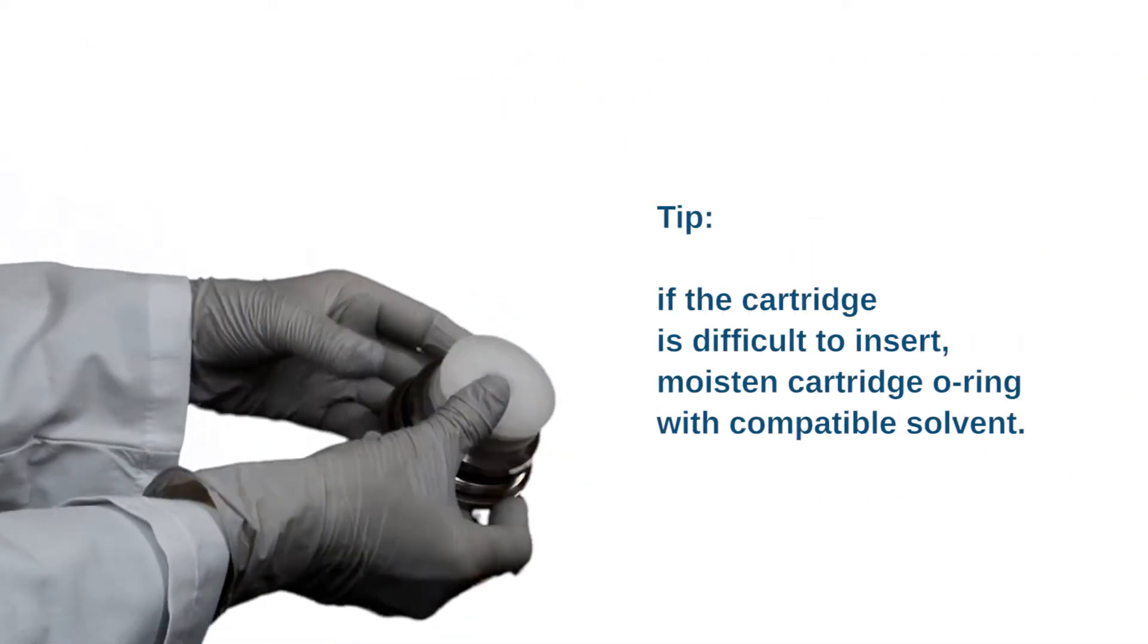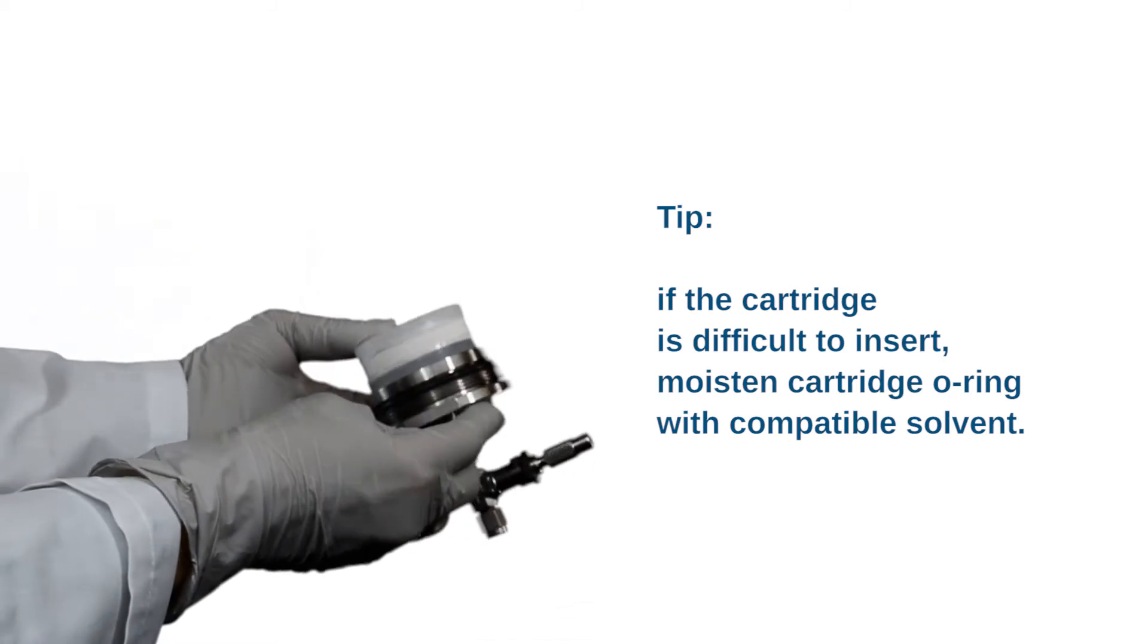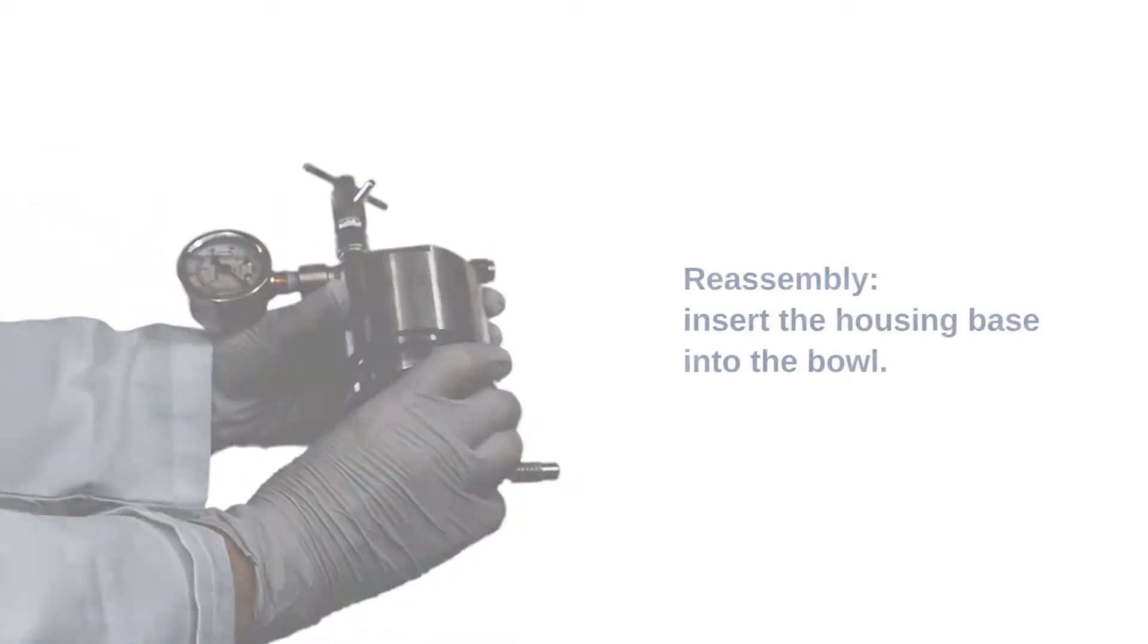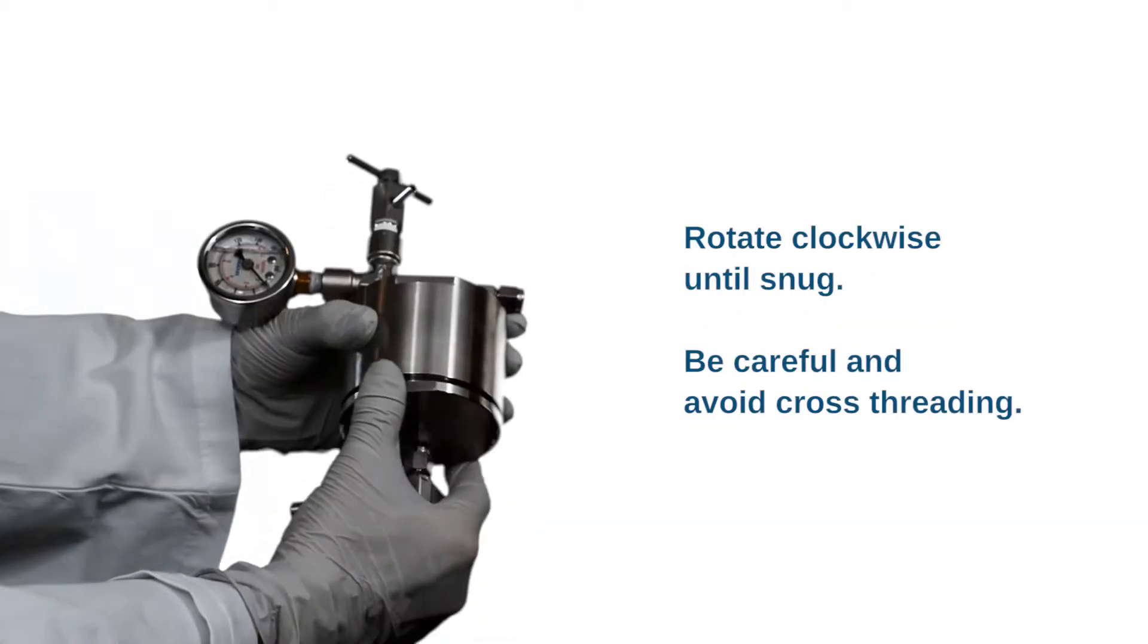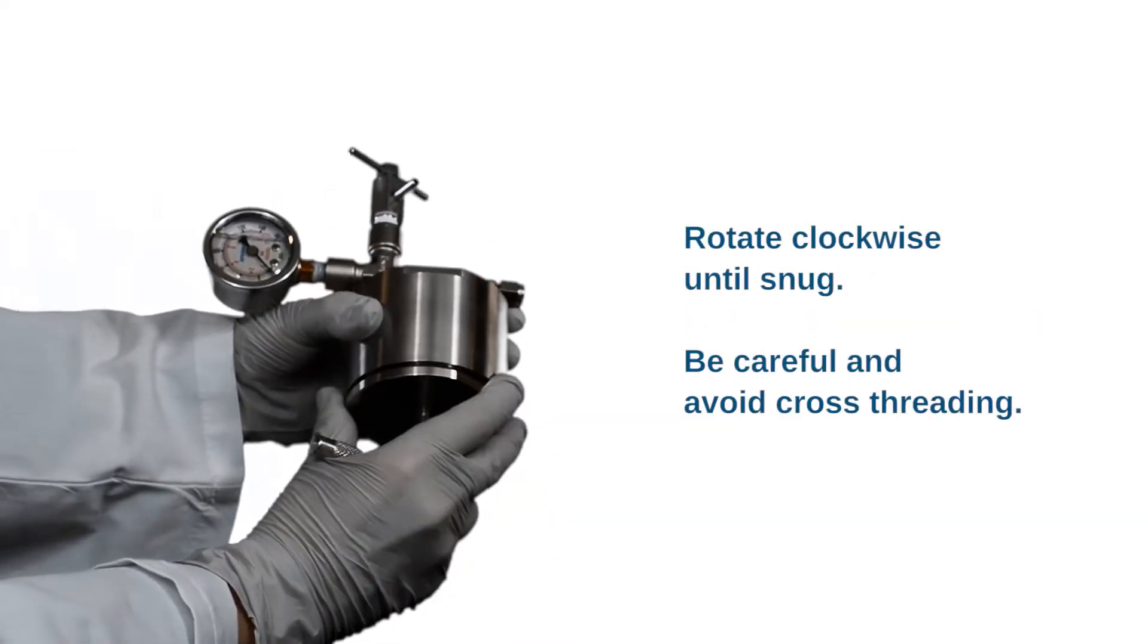If the test cartridge is difficult to insert, moisten cartridge o-ring with compatible solvent. Re-assembly: Insert the housing base into the bowl. Rotate clockwise until snug. Be careful and avoid cross-threading.